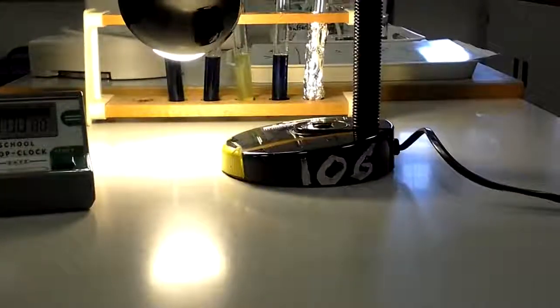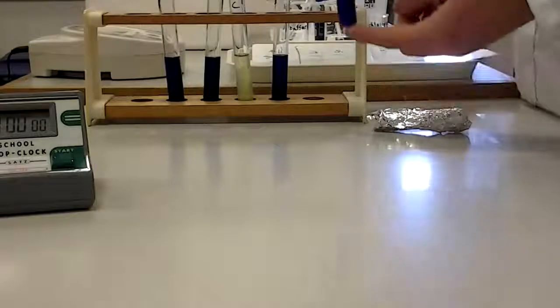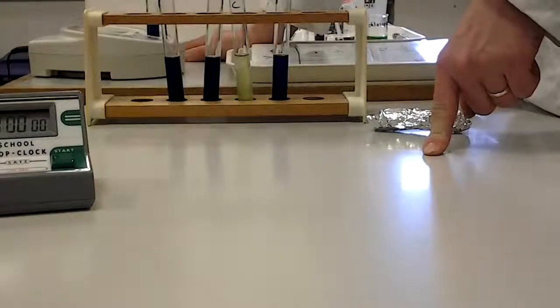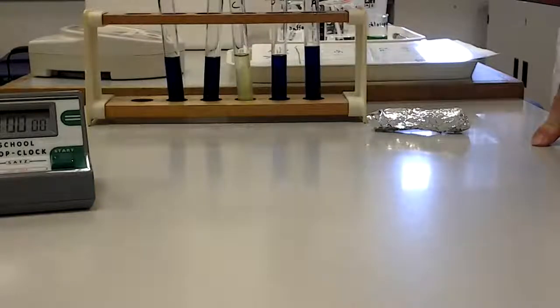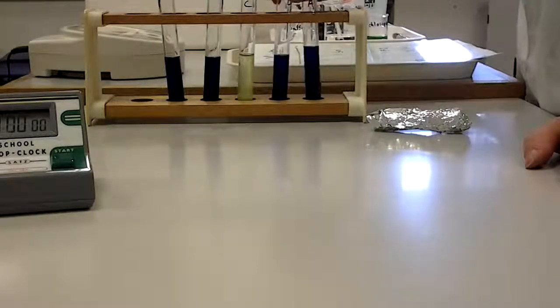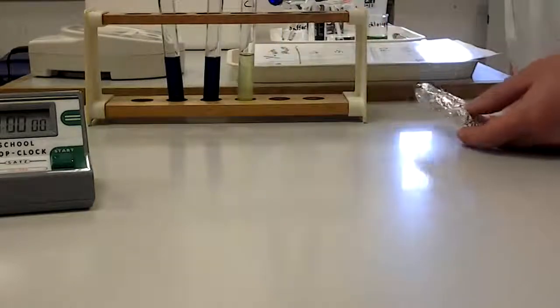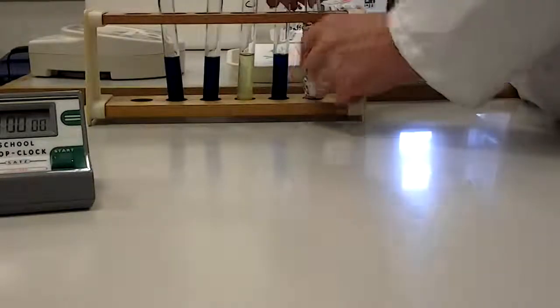We also need to consider our controls and what they tell us. The control tubes are A and B. Tube A had absolutely everything it needed for photosynthesis — it had chloroplasts and DC-PIP — it just didn't have light. Its absorbance reading is about 1.30, pretty much the same as the experimental tubes, so very little decolourisation has occurred there. Tube B doesn't have chloroplasts in it. Both tubes have been out in the bright light for about 40 minutes and there is absolutely no decolourisation. So these are our controls to prove that it is the action of light on chloroplasts that decolourises the DC-PIP.